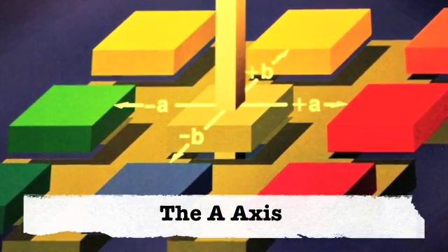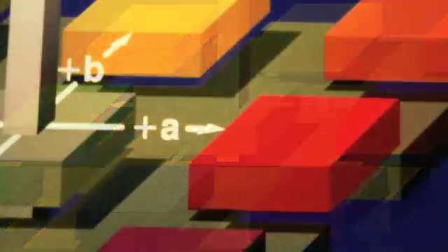Next is the A-axis, which describes the green to redness factor. A positive A would have more red in it, while a negative A value would have more green.